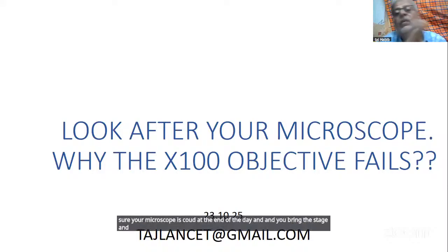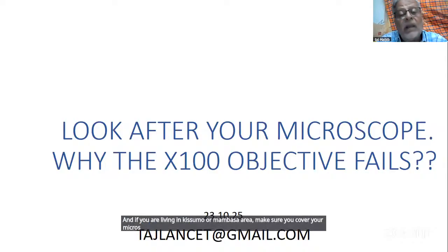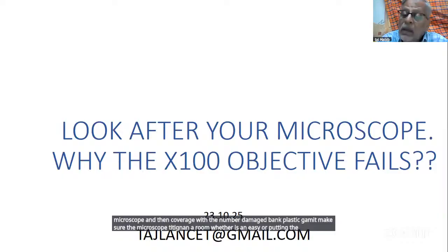If you are living in the Kisumu or Mombasa area, make sure you cover your microscope and then cover it with another plastic garbage bag. Seal the microscope, put it in a room where there is an AC, or put it in the cupboard. Don't leave it on the bench.